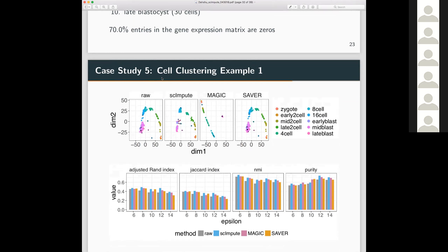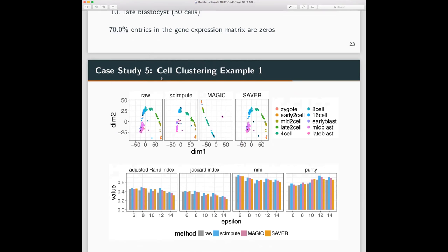And for the number of clusters, even though a good number of clusters as the initial value would, of course, assist the downstream analysis, scImpute is not highly dependent on this selection, because we have a second step of non-negative least square regression to further select the really similar cells and predictive cells from the candidate neighbor sets.